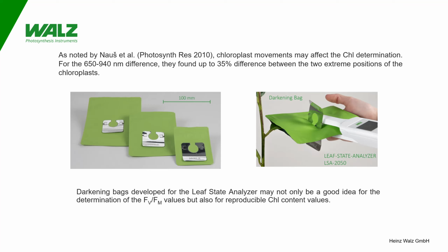To avoid unnecessary variability, it is a good idea to bring the chloroplast in the dark state position by dark acclimation. For this, green dark acclimation bags were developed. Dark acclimation is also necessary for the determination of correct FV over FM values.